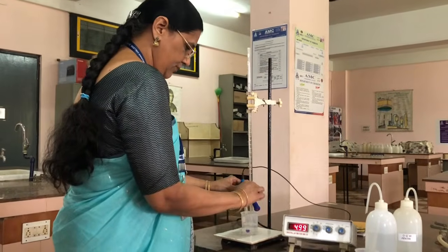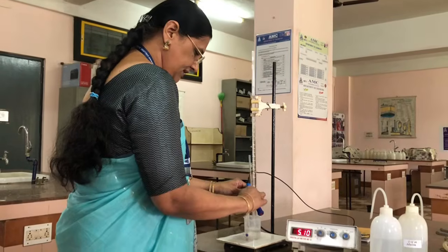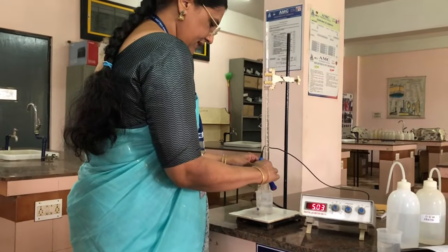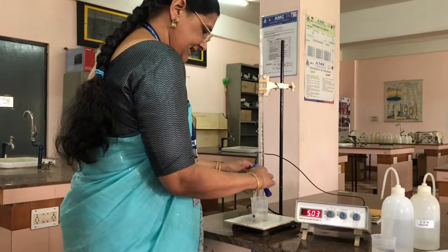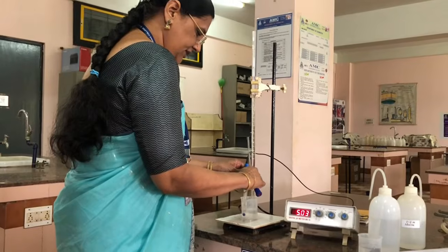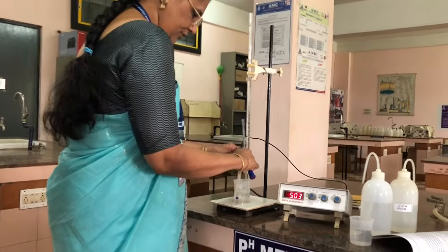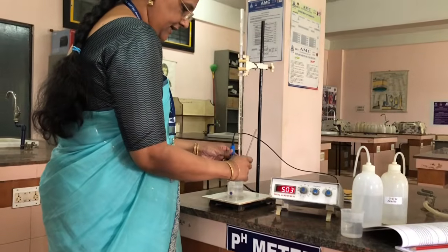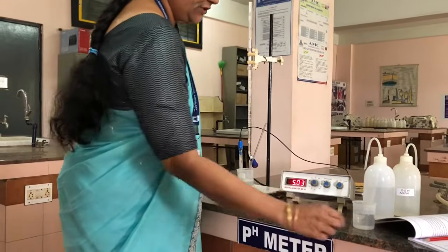Again after addition of 0.5 ml, we have to shake the solution, because when the H plus ion concentration is decreasing, it takes time for the neutralization reaction to occur. So we have to shake the solution for 2-3 seconds and note down the pH of the solution.